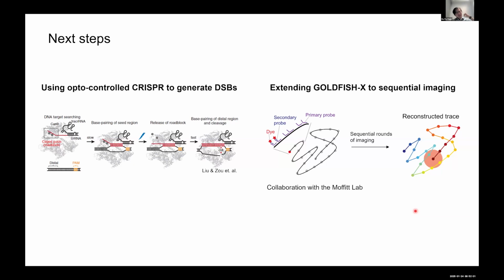So, the next steps. As I mentioned in the beginning, our lab has been pretty interested in studying the mechanism of DNA repair. So we want to combine this new protocol with the opto-controlled CRISPR tool that the lab also developed previously, called very fast CRISPR.